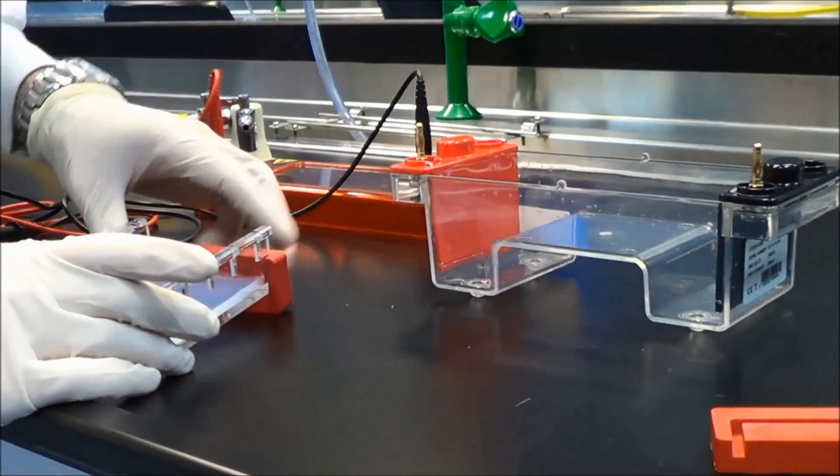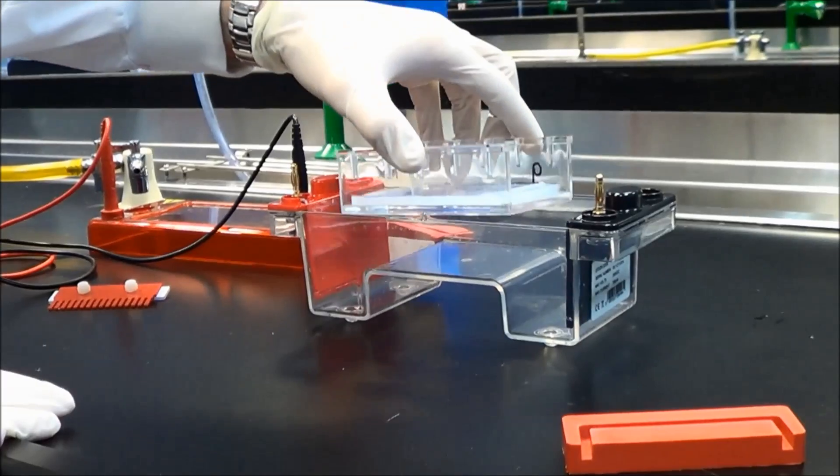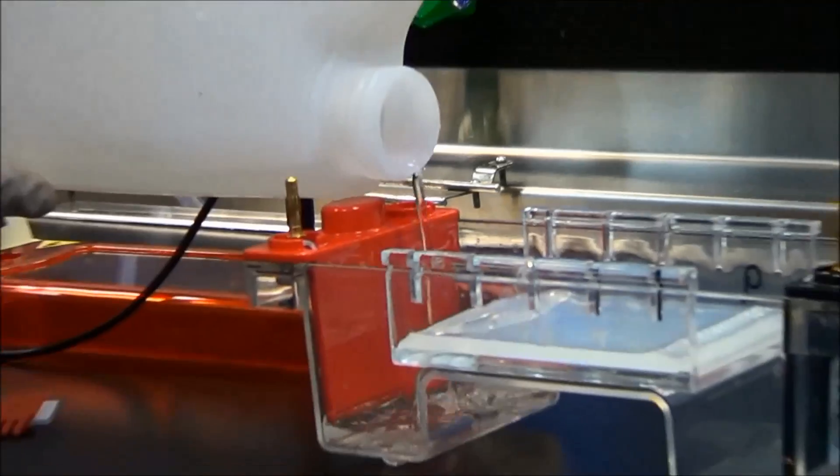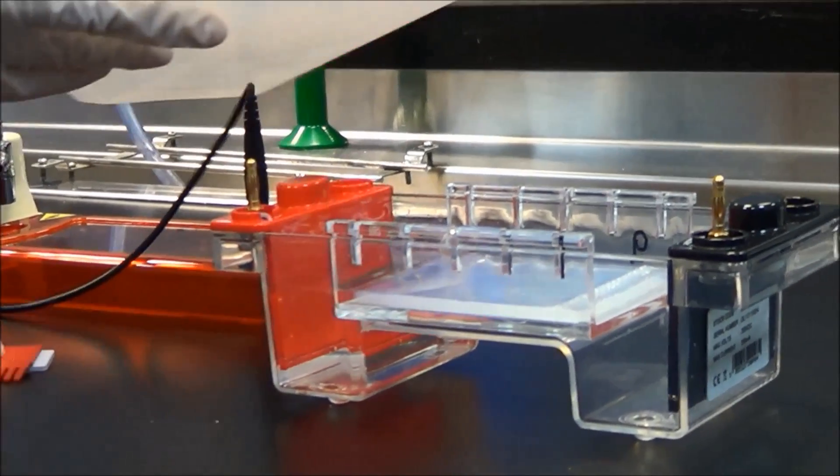Remove the casting dams and place the tray inside the gel tank. Add 1x TAE buffer to the tank so that it covers the wells in the agarose gel.